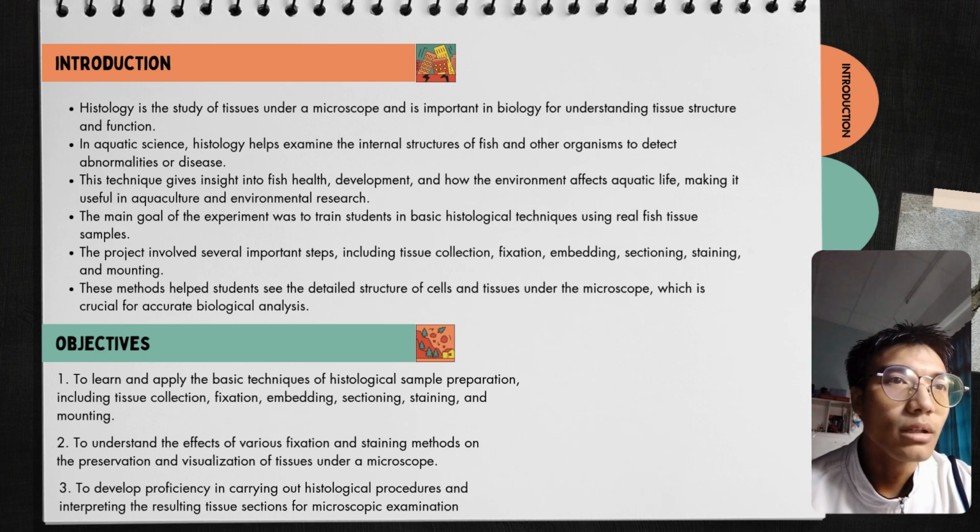This procedure made it possible to clearly observe tissue organization and morphology under the microscope. Understanding the rationale behind each procedure helps reinforce the importance of careful preparation in producing reliable scientific results.